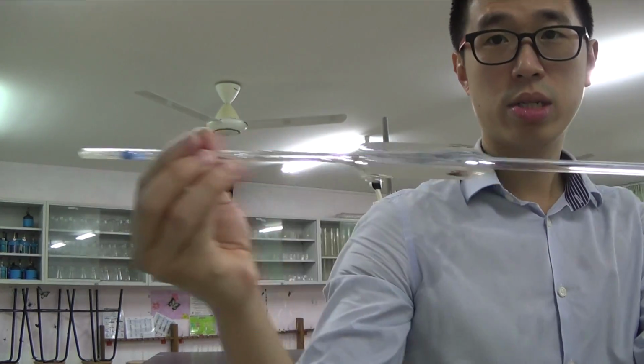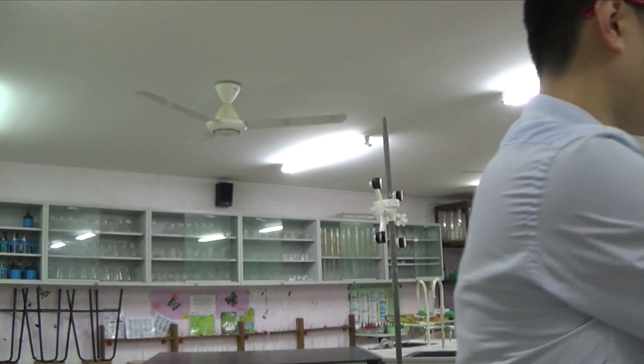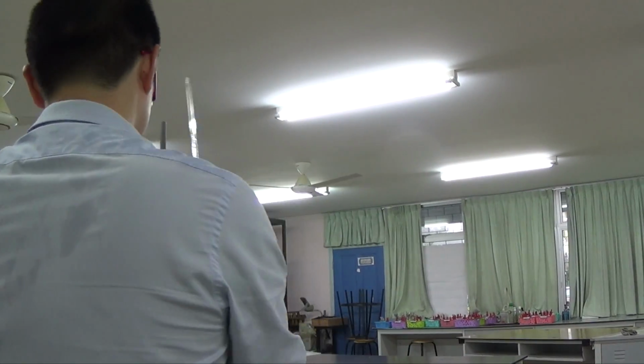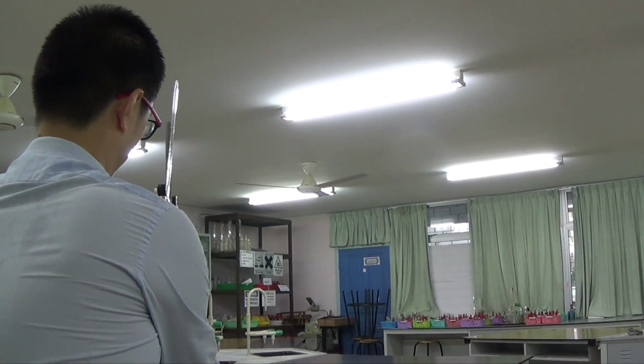As I'm rinsing, I want the distilled water to roll around the side, and then I drain it out from the very top end there. My sink is over there, hence I want to show you half my body here. So yeah, okay, I'm just going to let this go this way around.